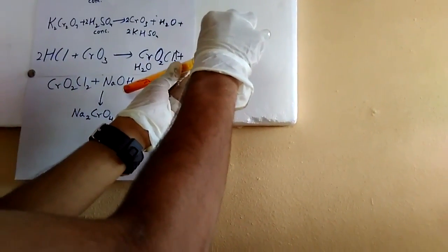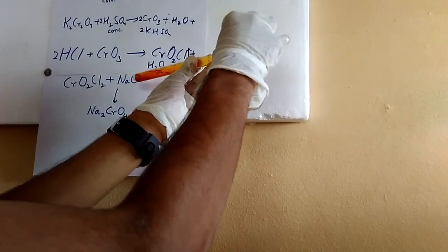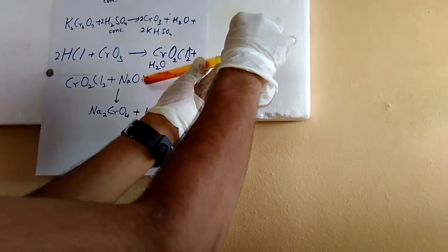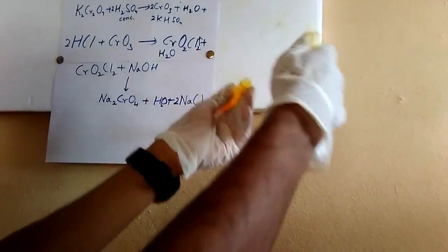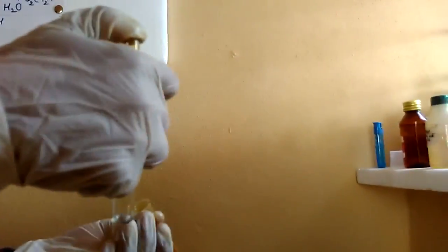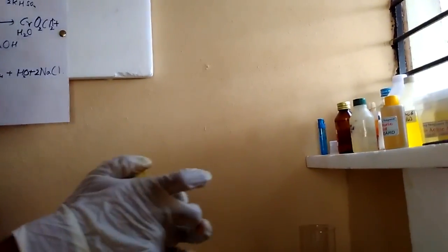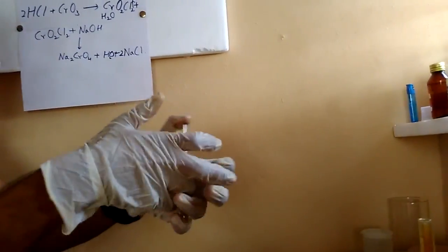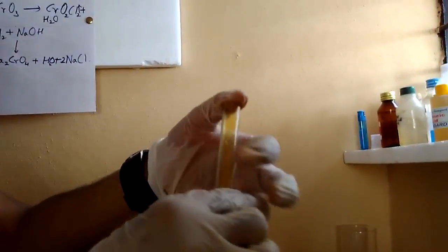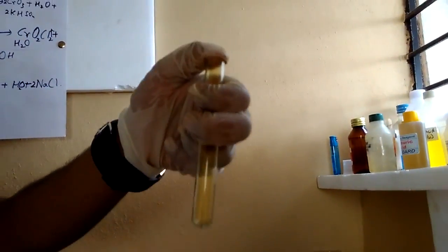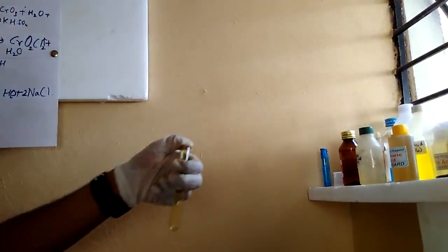We are done with the first step of chromyl chloride production. In the second step, I have taken some of the chromyl chloride gas in another test tube.